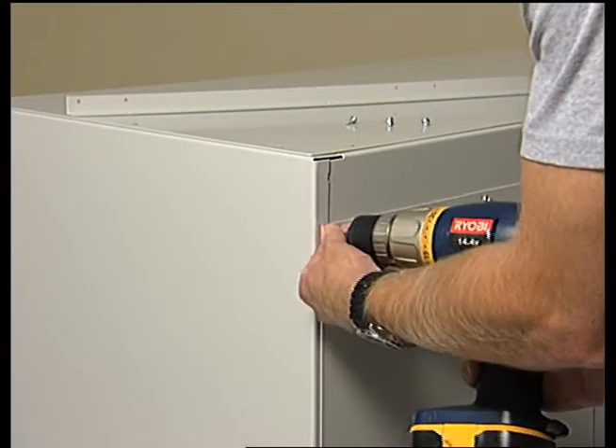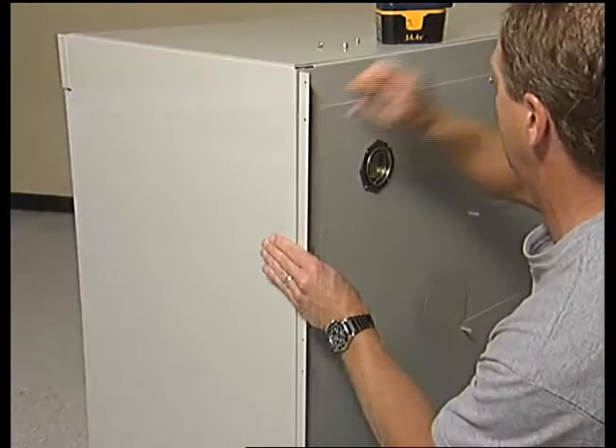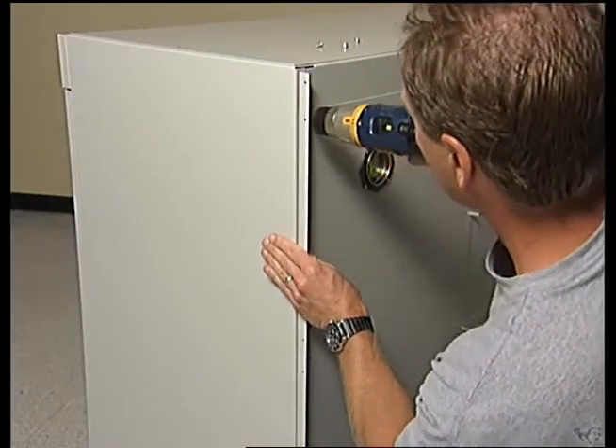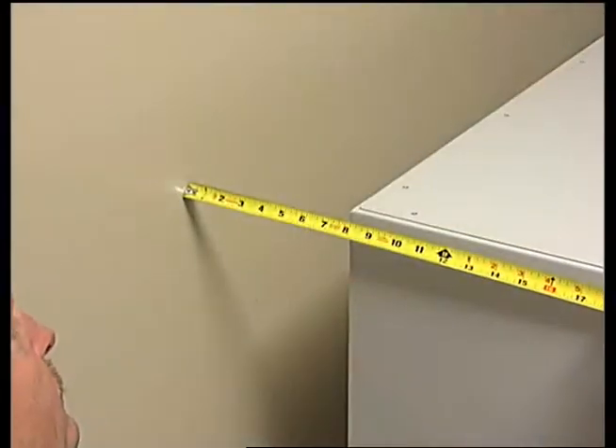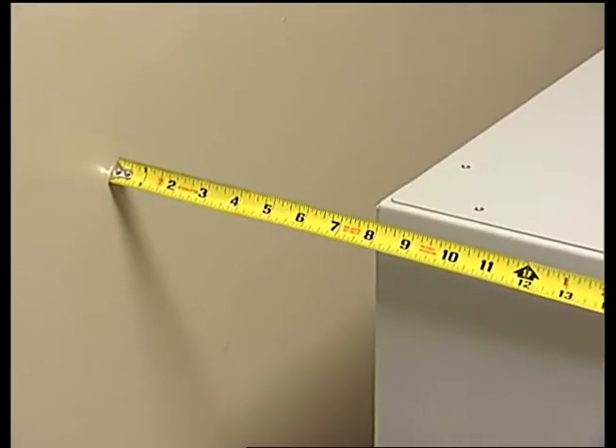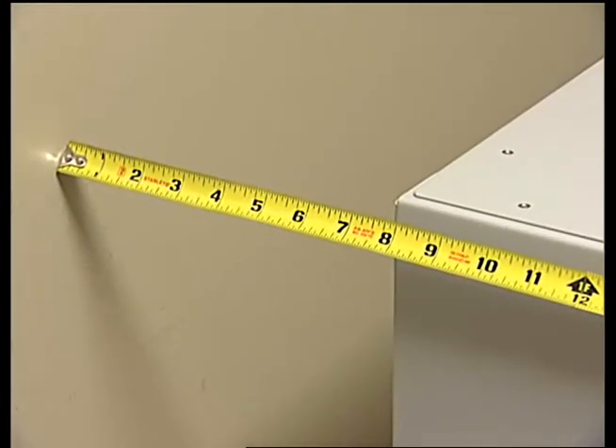Remove the four screws from the rear corner of the cabinet, then attach the panel angle directly to the back wall of the cabinet using the same four screws. Place the base cabinet in the approximate location near the ductwork connection and 8 inches from the wall to allow for utility connections.